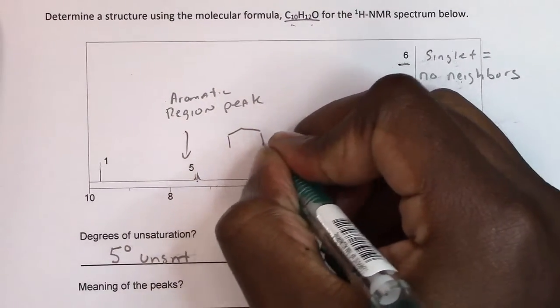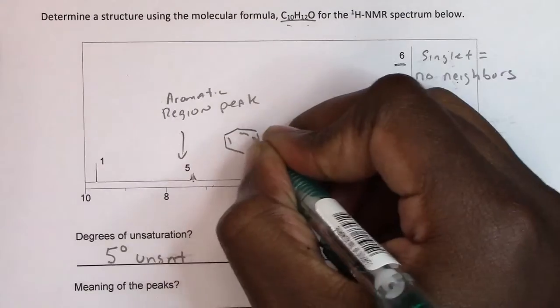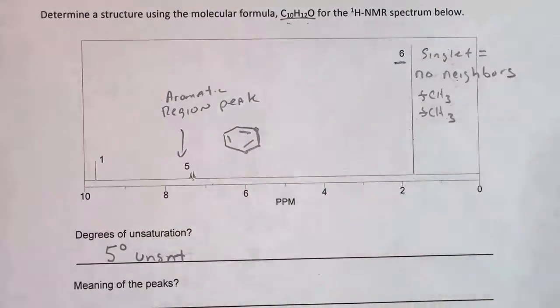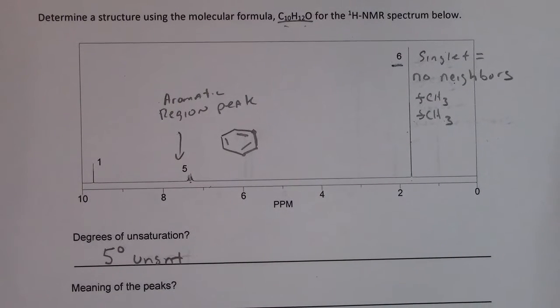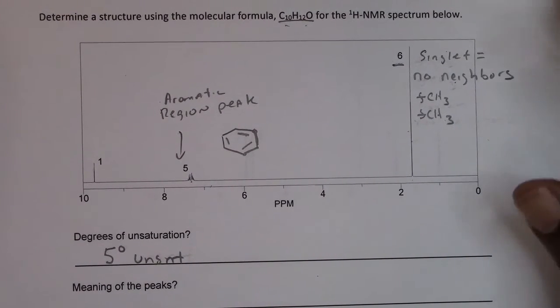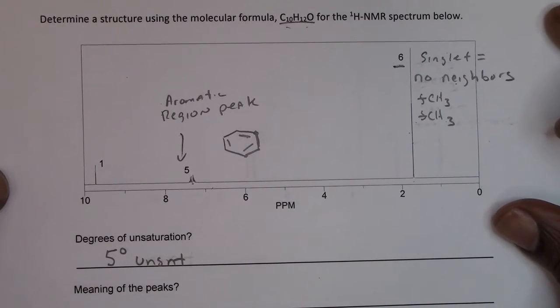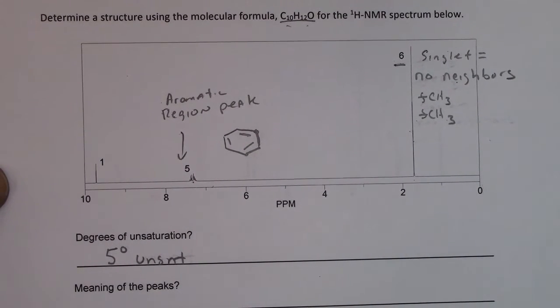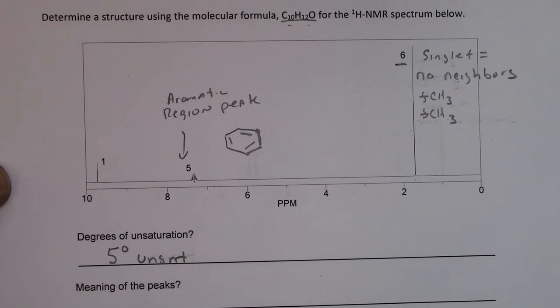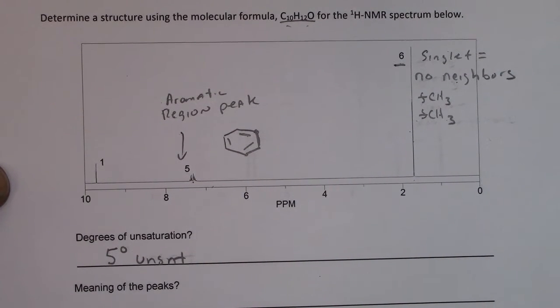If you go into higher levels of organic chemistry, you will deal with spectroscopy where you are not really allowed to make this determination. But at the level of organic chemistry you are studying, it's safe to make this assessment at this point. Now you need to ask yourself, how many times is this ring substituted?